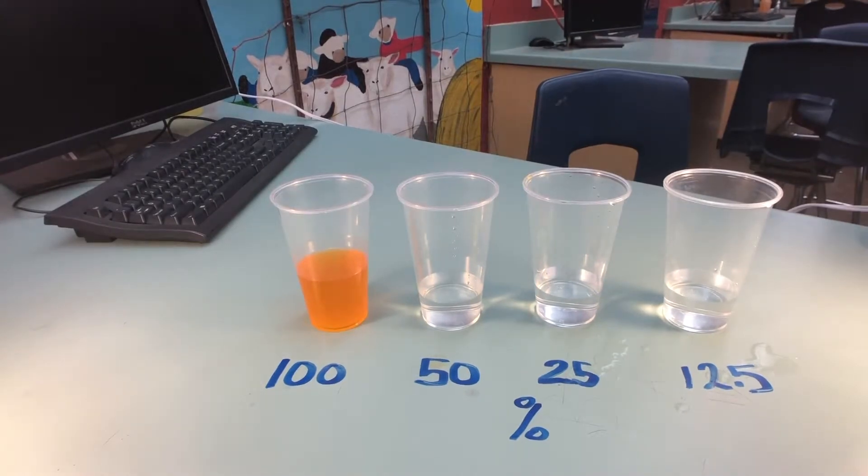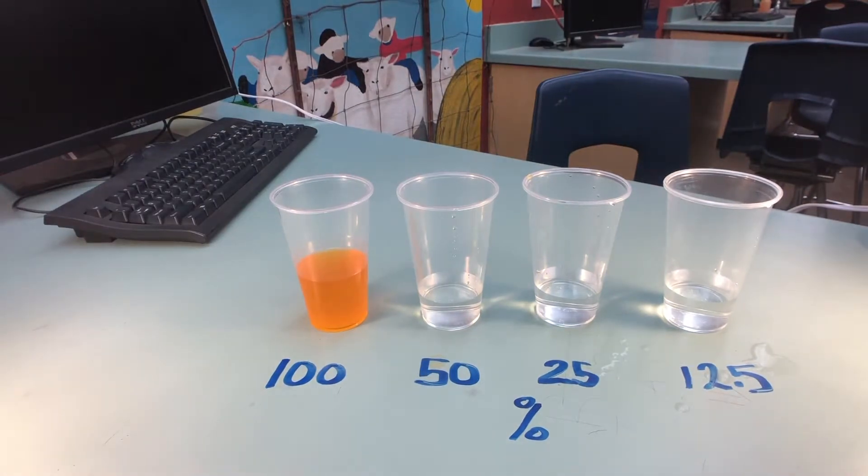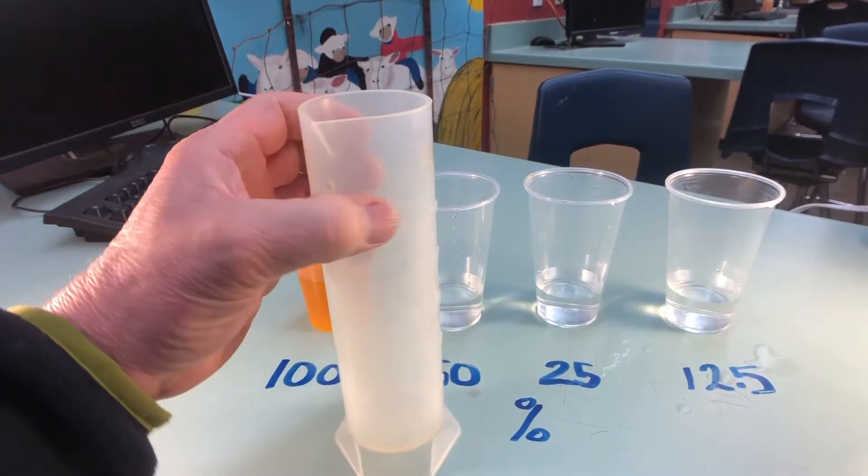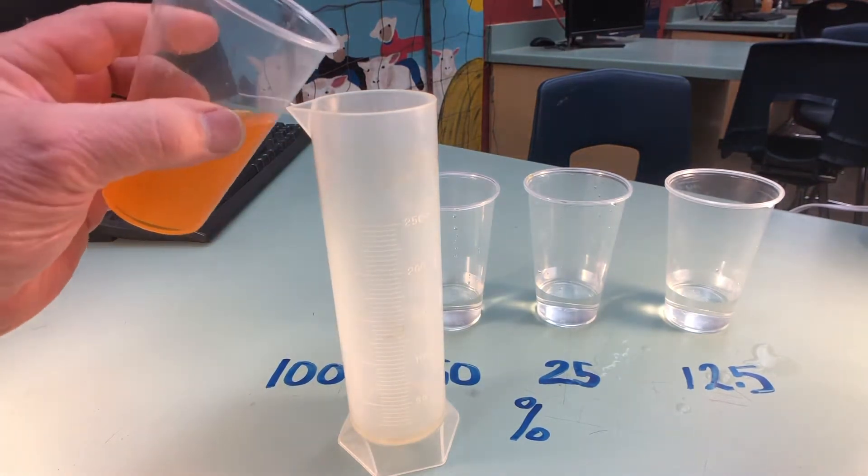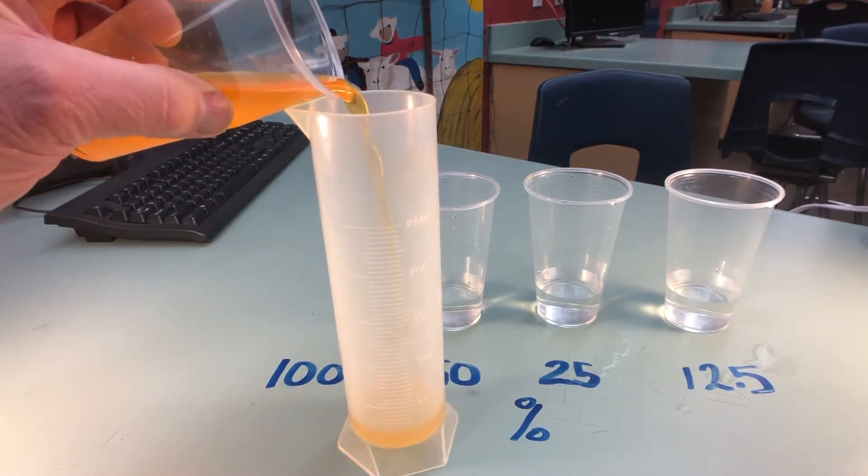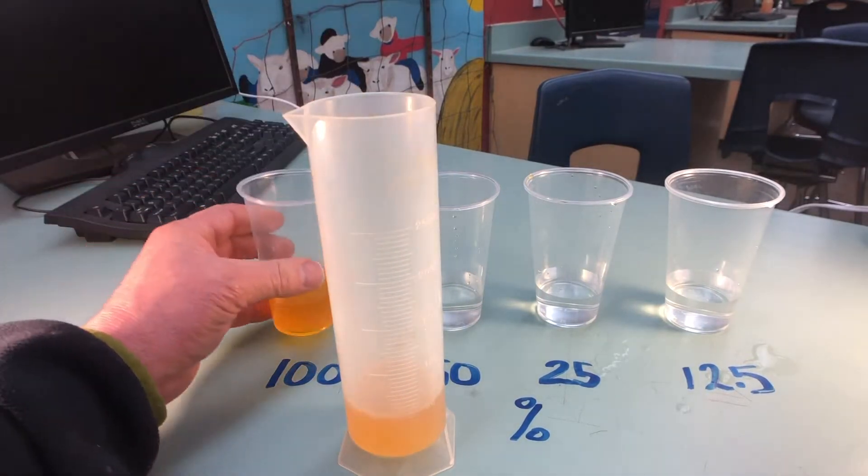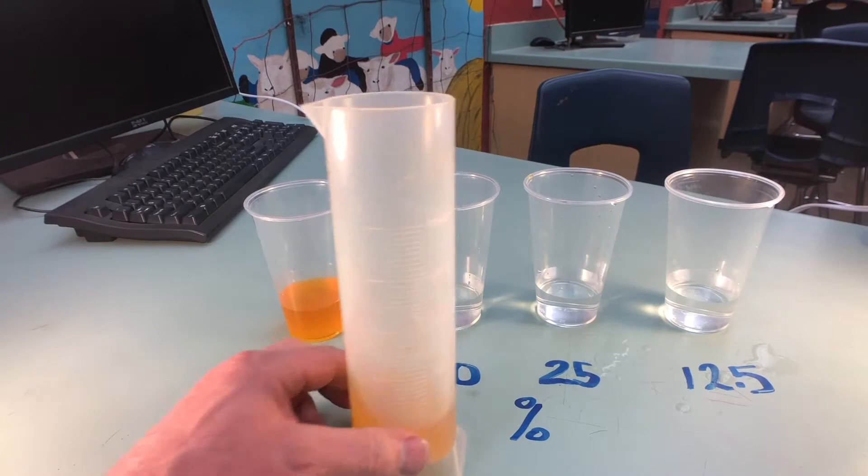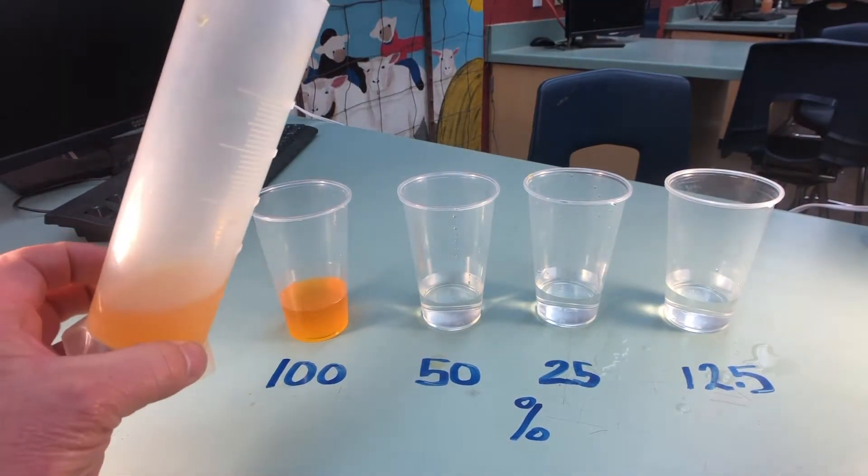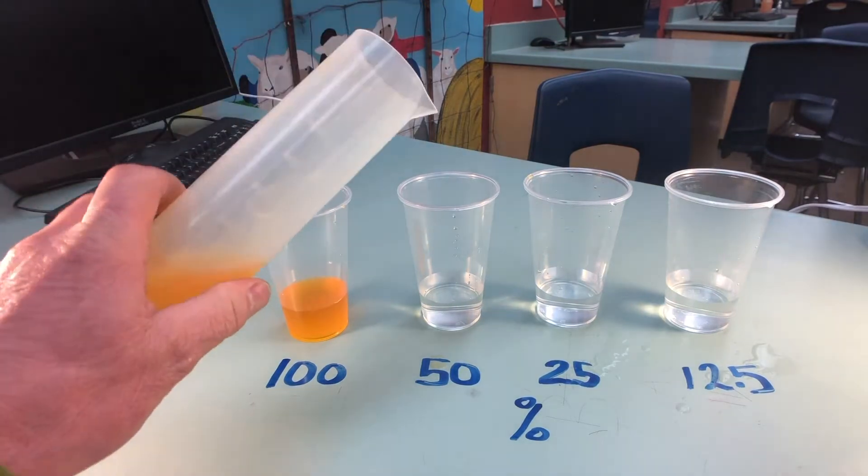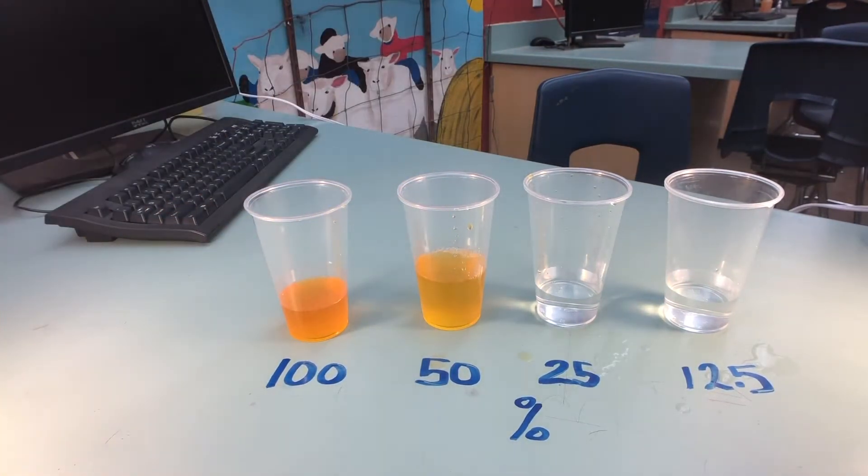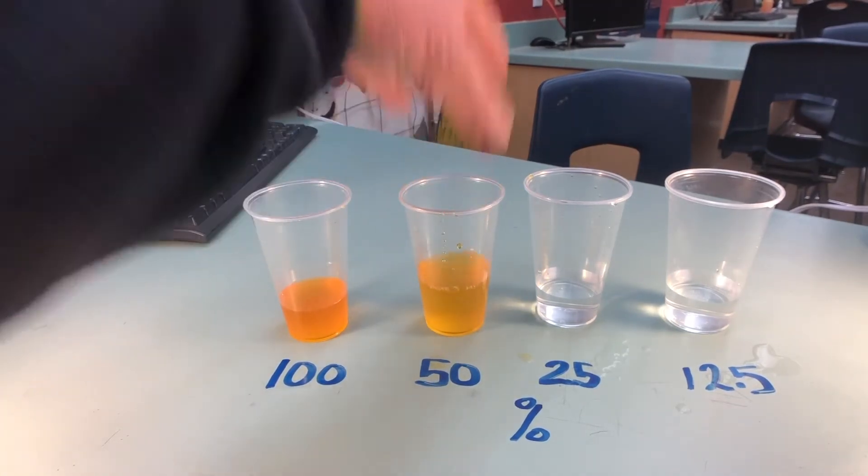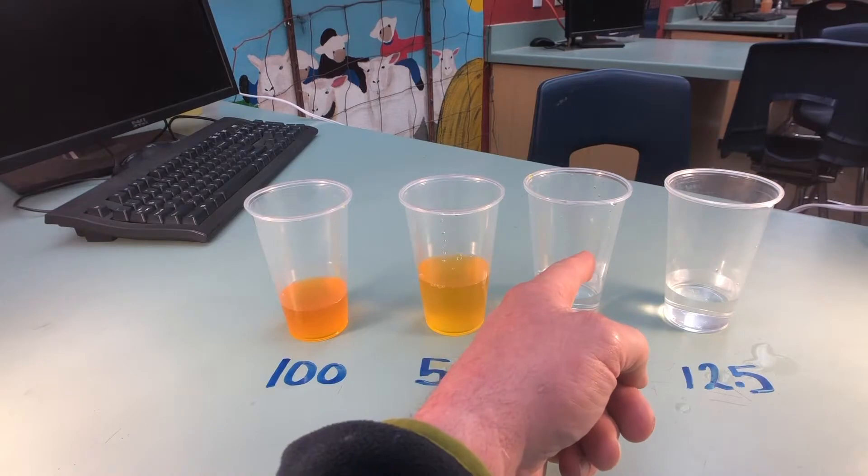Set that aside and now what we're going to do is take 50 ml's of the 100% solution and put that in the 50% cup. And again using the graduated cylinder carefully measure it out so you get exactly 50 ml's. Checking that is kind of critical. So we're just going to go ahead and pour that 50 ml's into the already 50 ml's container. And that will make a serial dilution of 50%. I'm going to give it a little shake there to make sure we get good dilution.